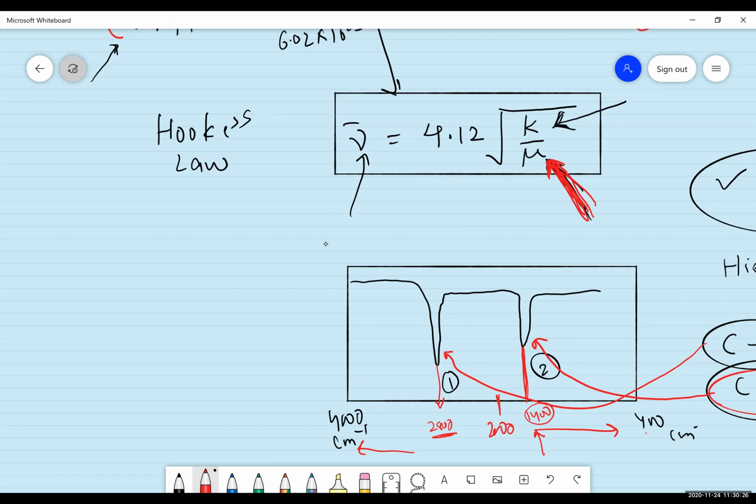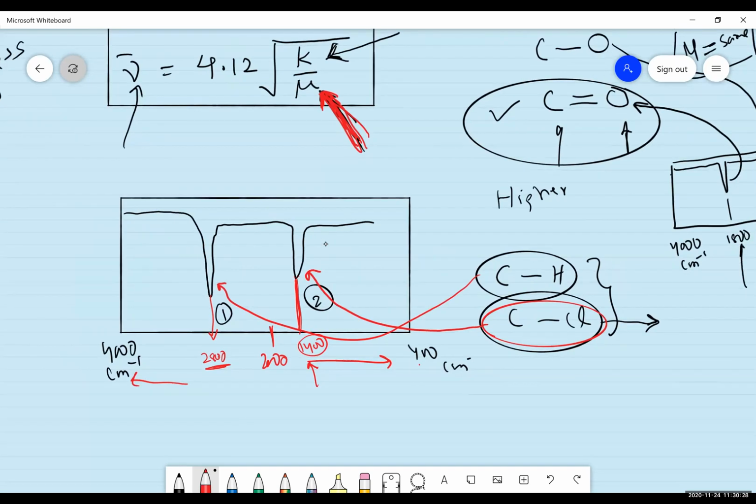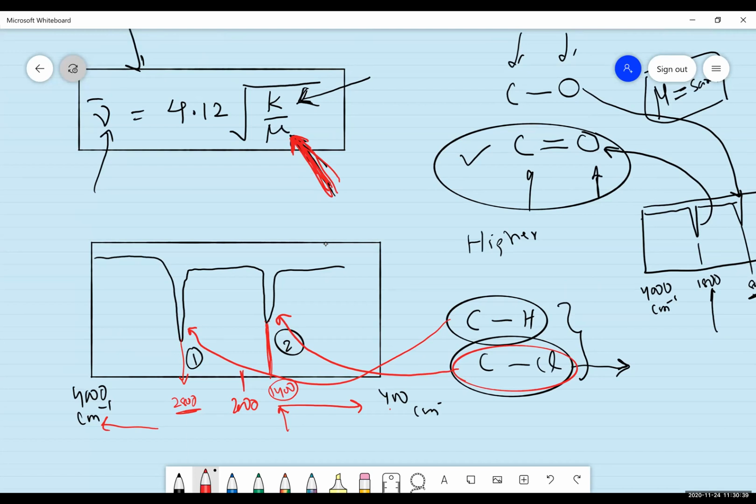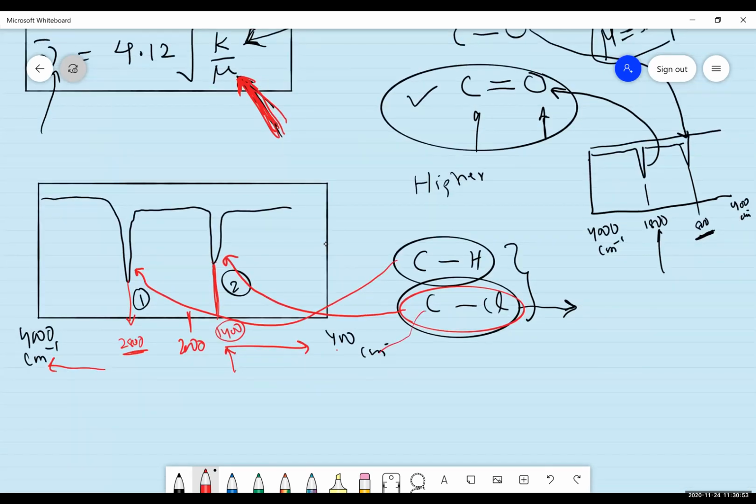Professor, I just have a question. Yes, I was waiting for just a little clarification. So the wavelength of these, to what extent is it influenced by the other atoms attached to the carbon in question? A little bit, but not a lot. You mean if something else is attached here? Yeah, like assuming that the Cl is attached to that CH and possibly a CO as well, or there's an oxygen, chlorine, and a hydrogen.